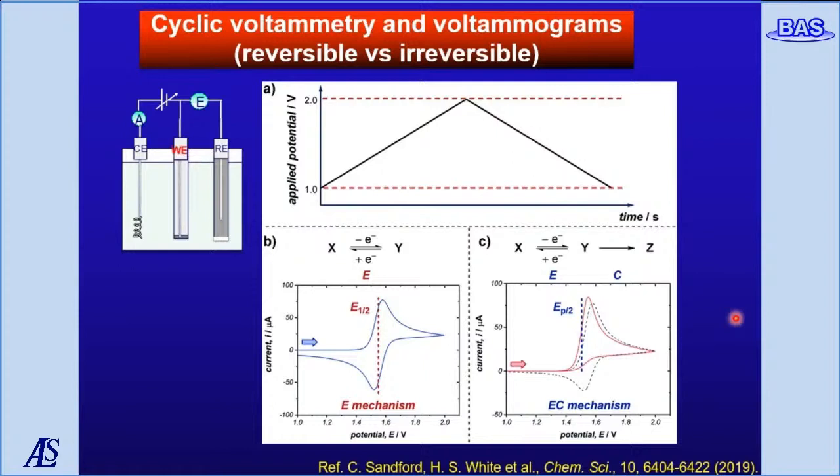Two typical CV responses are shown here, reversible and irreversible CV. The reaction schemes are labeled by a string of letters signifying the reaction steps.